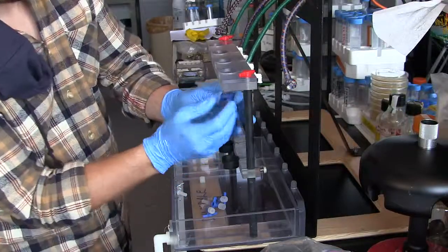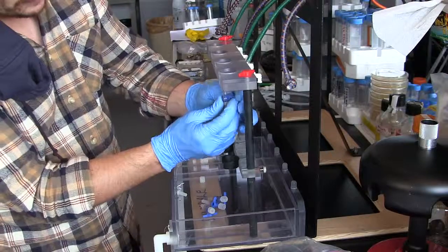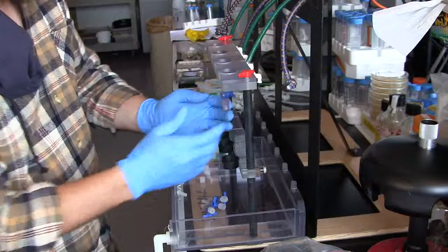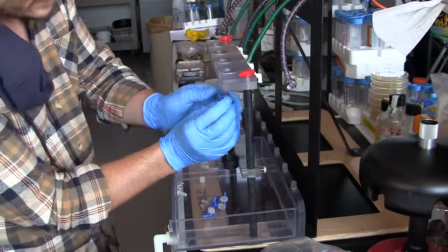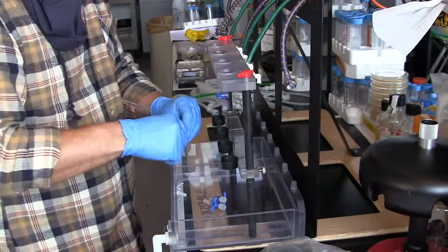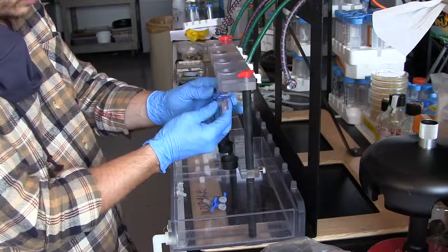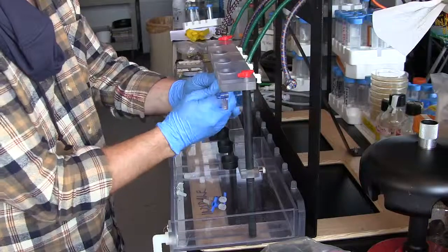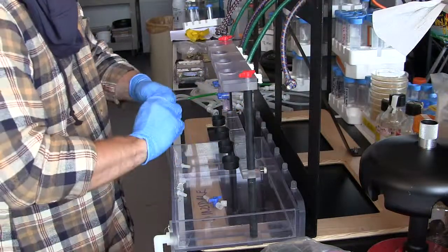You can make it so that it will start threading when you have the handle for the valve at the back, and it will twist around and end up at the back, which is not really what you want. So you always want to have it so it's facing you when you start screwing it in, and it ends up at the front. So we'll do that for all 4 of these. No, wrong way. Alright, have them nice at the front.